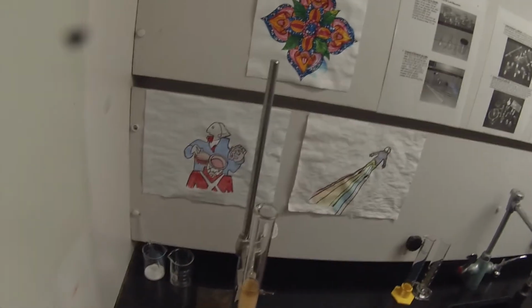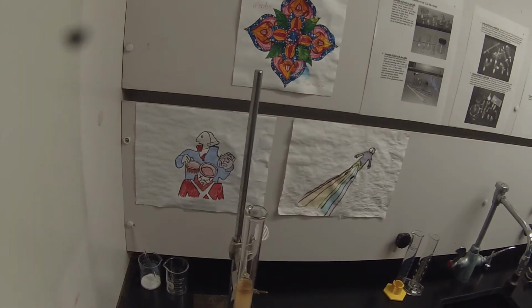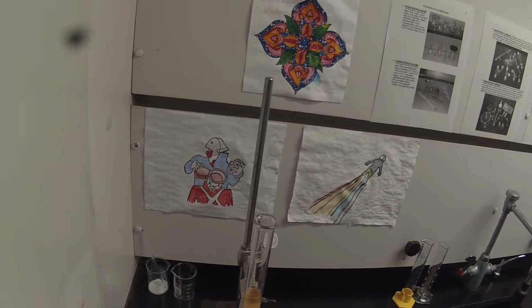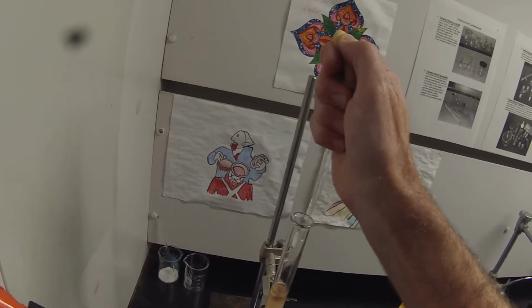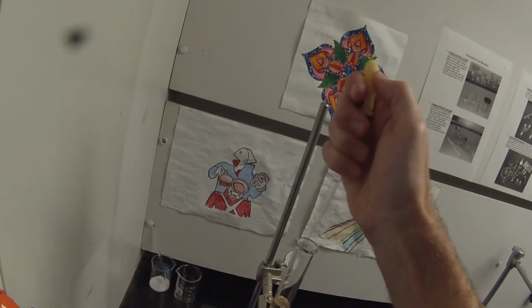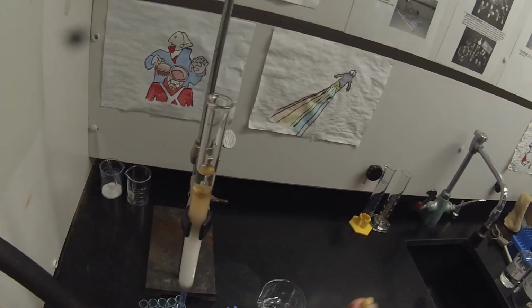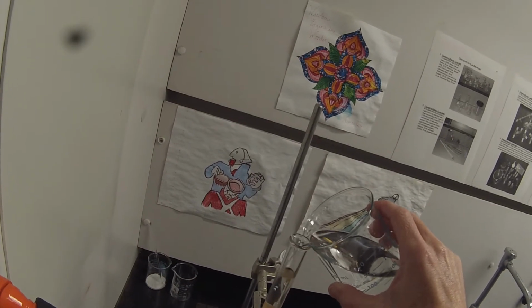And if you've got money, that creates a nicer, smoother result in the column. So now I'm going to add my 1 to 2 PET ether diethyl ether mixture, which is increasing the polarity. Everybody should start moving a little faster. And once I have enough in there that I can be sure to pour it without disturbing the top, then I can pour it in.